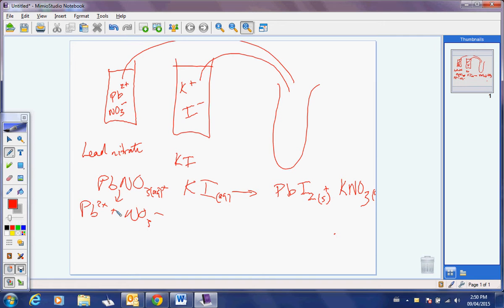So what's happening in the test tube? They're coming together. The lead iodide is like stuck to the thing because it's the solid precipitate. What's stuck to what thing? Well, I don't know if it's stuck, but that's what the chunks are. That's the precipitate. Okay, that's a solid. Good. Okay, so here's some solid. There's some solid within my solution. And in fact, if I wait long enough, all those solids are going to settle to the bottom. Okay?